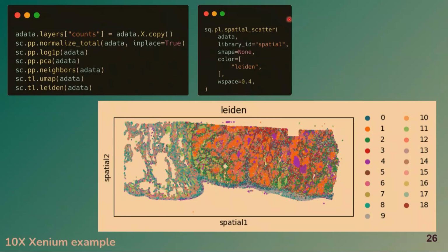And here we have an example of pre-processing that is normally made, which involves initially data normalization, PCA, data reduction, and UMAP to identify core features, and later clustering, which is a graph clustering, and later visualization.